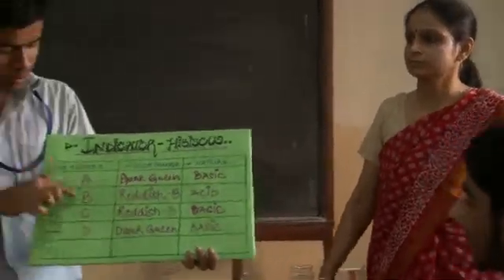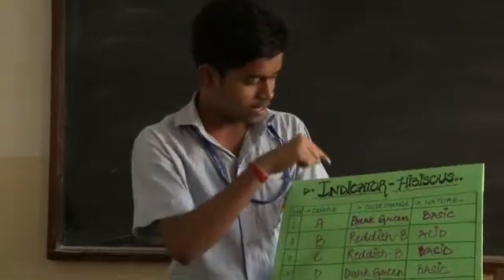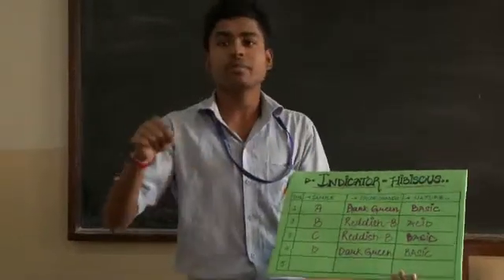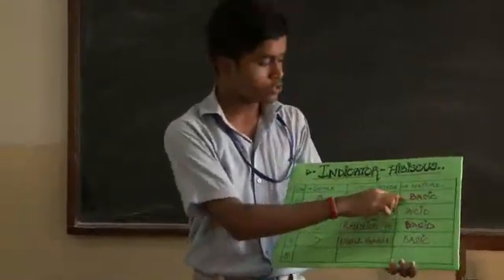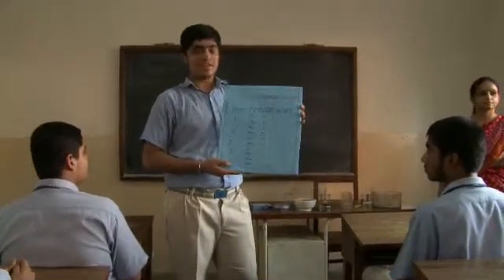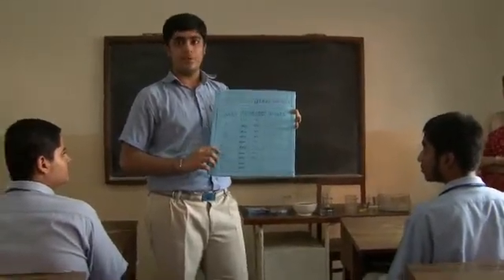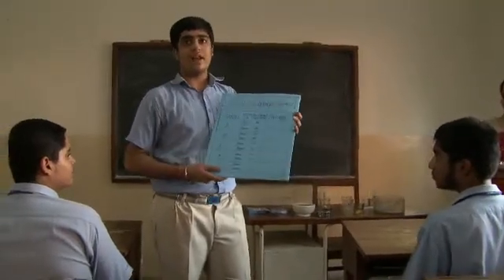So we had 4 samples and we had taken the hibiscus indicator, and we had put a drop on each sample. When we put the hibiscus indicator in sample A, it turned dark green, which shows that the nature is basic. We used litmus papers as an indicator. Samples A and D changed the red litmus paper to blue, so we conclude that samples A and D are basic.